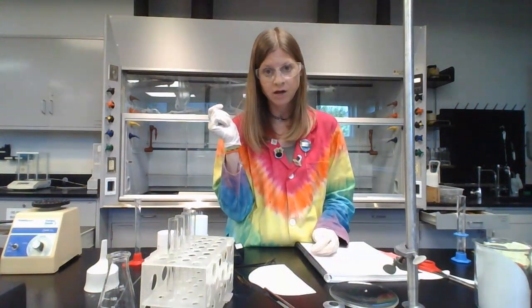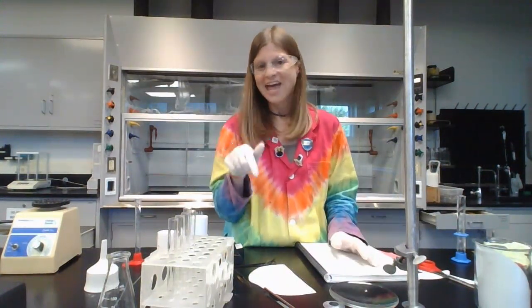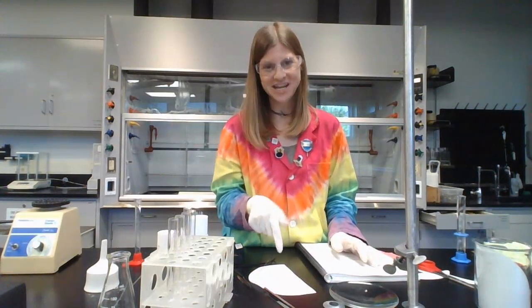So at the end of the lab, nothing goes down the drain. I know it's aspirin. So number 1, you can't take it home. I don't care if it's like aspirin, I can buy that. I don't know that you made aspirin. Let's even say both tests make it look like you made aspirin. Still not good enough for you to take it home and eat it or something. I don't care if you want to become a pharmacist. You still can't take the aspirin home, okay? So the aspirin has to stay.